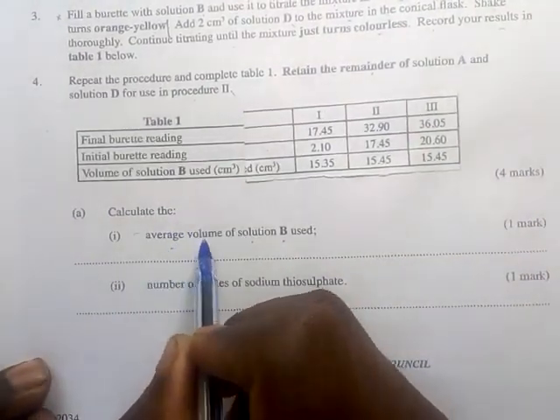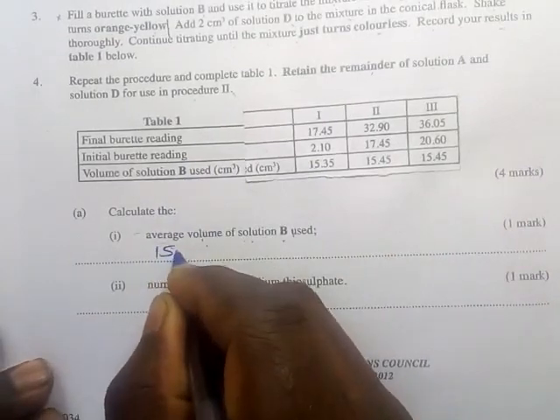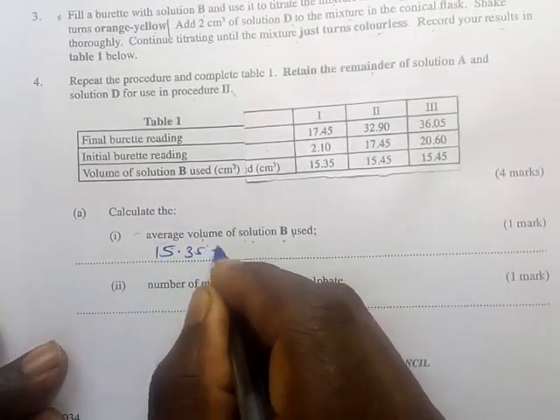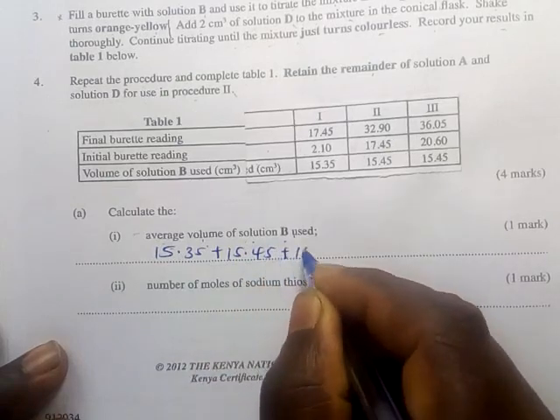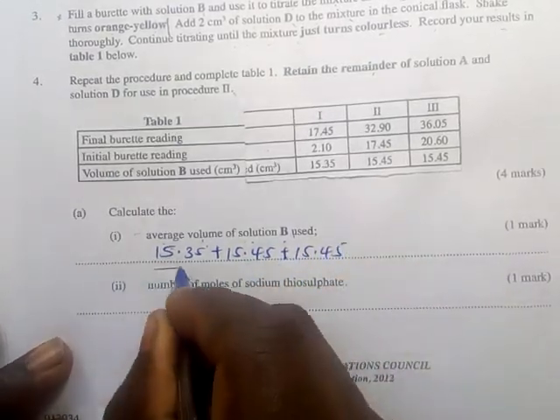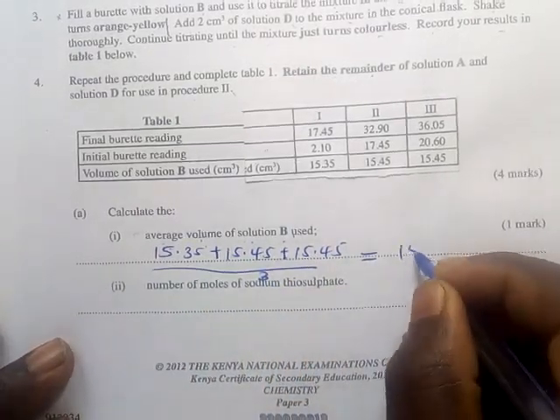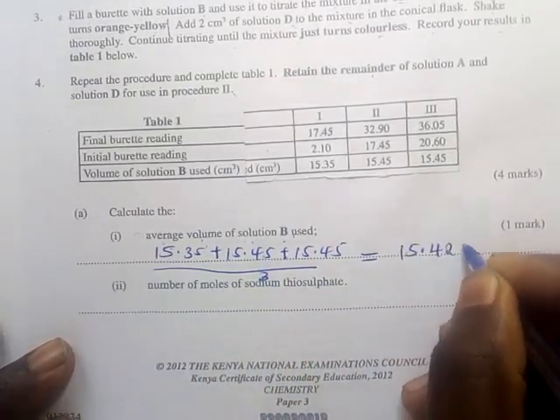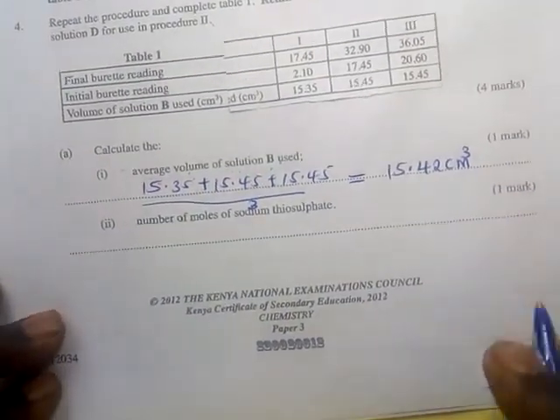Calculate the average volume of solution B. The average volume of solution B used is 15.35 plus 15.45 plus 15.45, divided by 3. This gives us 15.42 cm³, and that is our average.